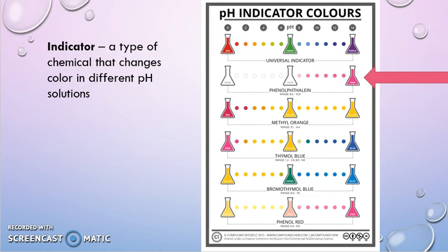The second reason that phenolphthalein actually is pretty important is because it tends to change color right at around a neutral pH. Honestly, it's slightly above neutral, around a pH of 9, but it's still pretty good for what we're actually going to be using it for.